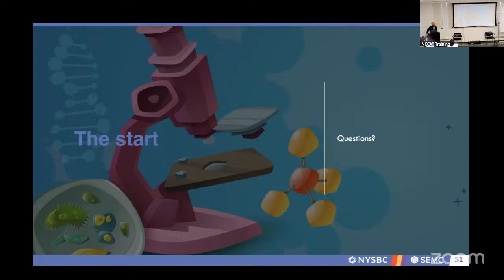We can run all sensors in a way that is very similar in terms of throughput and in terms of data quality. I think the best thing you can do is just go downstairs and ask your operator, can I run my sample on both microscopes so we can compare and contrast? That's one difference here from other places. You might think, what if I did this, what if I did that? We can do that here empirically. The reason I'm couching is that it's really sample dependent, because on a test sample we can get the same resolution on any setup, but most samples you're dealing with are not going to be apoferritin. And again, we're not the Center for Apoferritin Research. We want to do real biology.